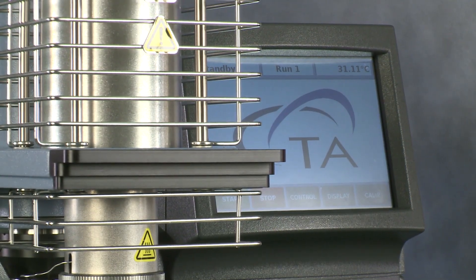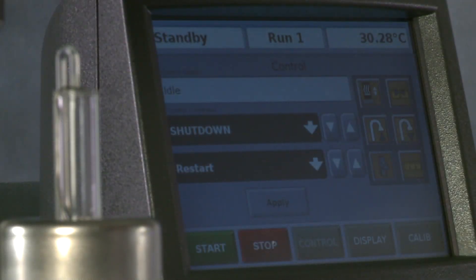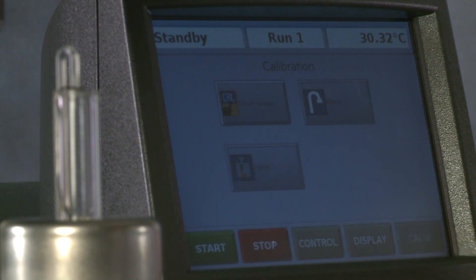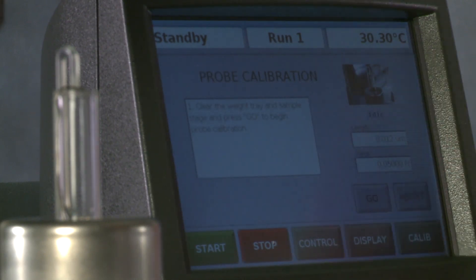For better results, it's recommended to close the furnace, but for the video I will leave it open so you can see what the probe is doing during the measurement. To calibrate the probe, we will go to calibrate on the touch screen of the Q400 and choose probe.